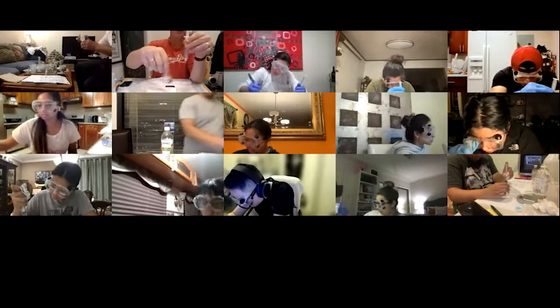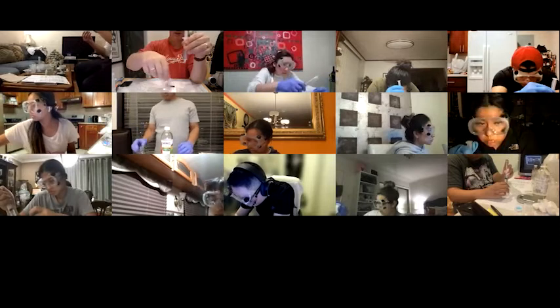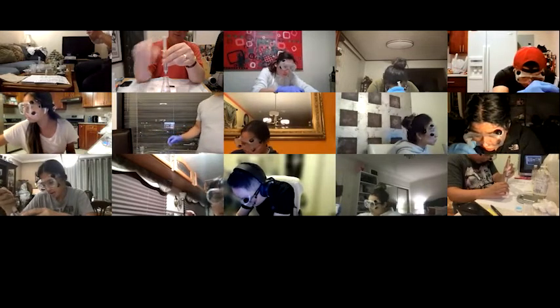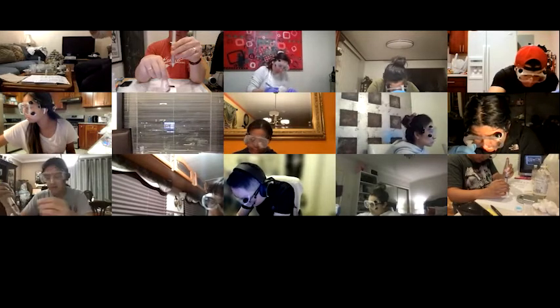Yeah, don't rush. You don't want to rush it because I'm getting super close here. I just want to go drop by drop at this point. Add a drop, swirl it around.